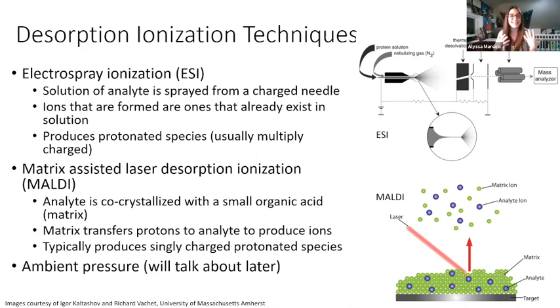What I mean by that is, anytime you give any chemical species some charge, create an ion or generate an ion from it, there's a lot of energy that goes into that, okay? And what can happen if you input a lot of energy into something with bonds in it is those bonds can break. And that is called a hard ionization technique. Electrospray is a soft ionization technique. It's kind of like a gentle transfer of a proton or taking away an electron from your sample.